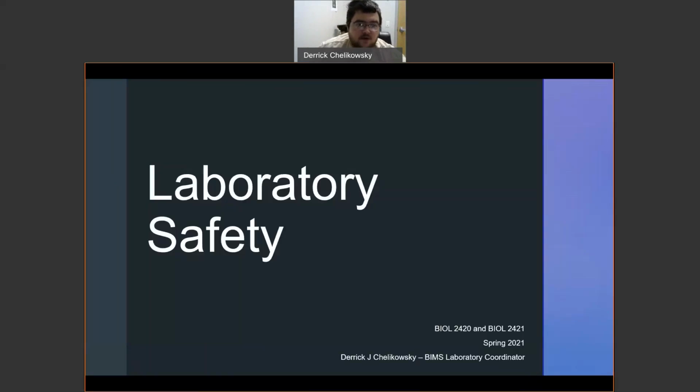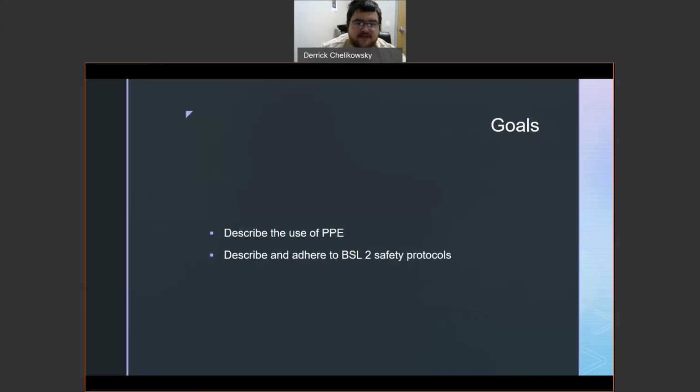So this is our laboratory safety for biology 2420 and 2421. The goals of this are to describe the use of PPE, and describe and adhere to BL2 safety protocols. This also has our labeling protocols in it, as well as in a different PowerPoint on a different video from earlier today. I recorded it earlier today. It'll be up on YouTube later today.